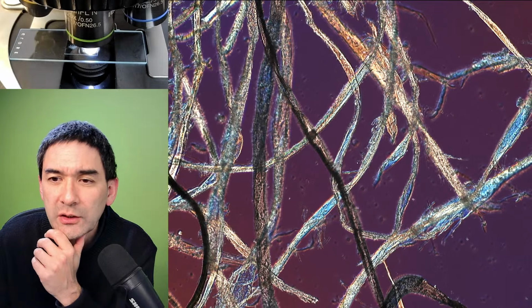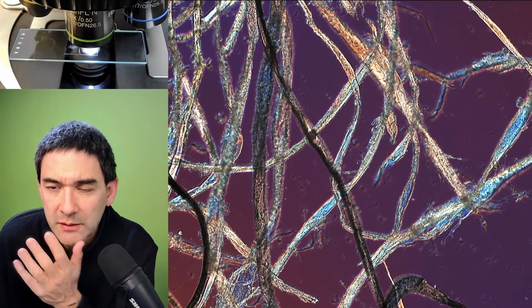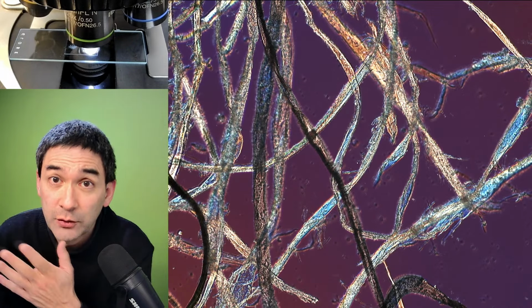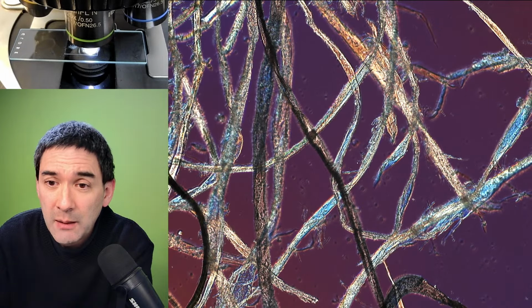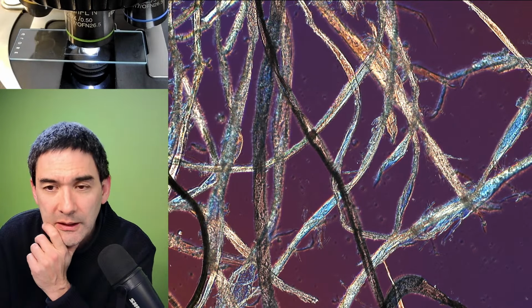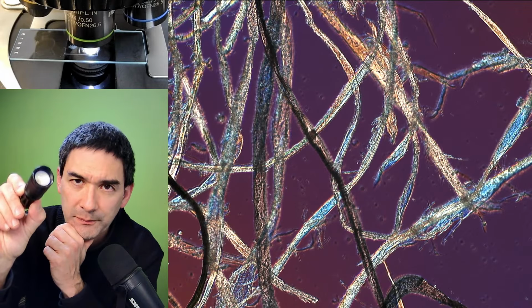Would it be a cool idea to watch bacteria being killed by UV light under the microscope? First of all, yes, UV light does kill bacteria. I did some experiments already, and UV light is actually used to disinfect rooms in hospitals and labs, for example, overnight you turn on UV, and this will actually kill bacteria. However, I don't know if you're able to see it that well, because some bacteria, it has to stop movement, and I doubt that this here is strong enough.